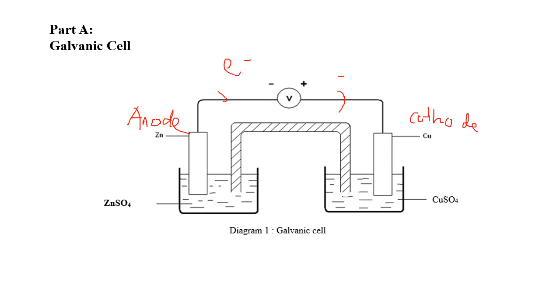So you have to check the concentration of the zinc sulfate and copper sulfate. And remember, here it is 35 ml. You have to measure 35 ml of zinc sulfate by using a 50 ml beaker. Alert, this one is a 50 ml beaker.